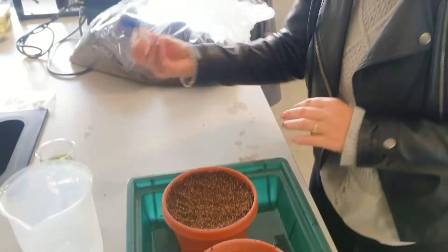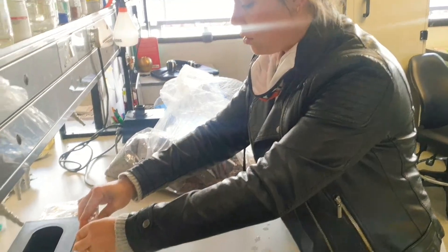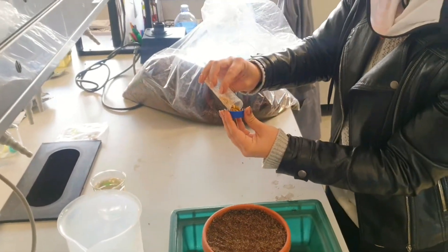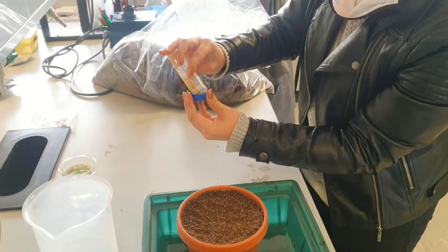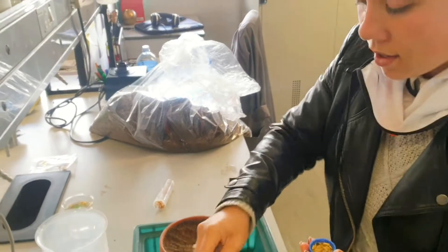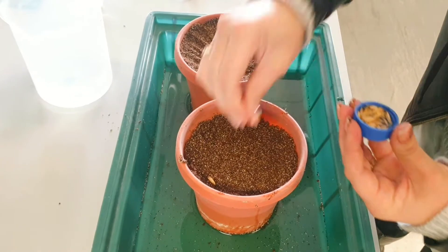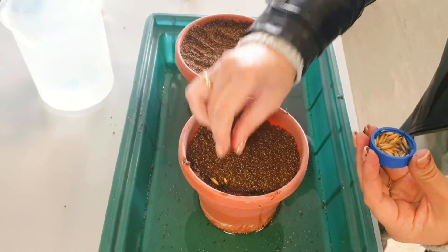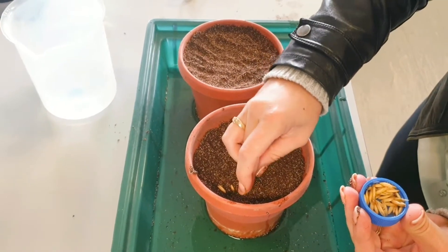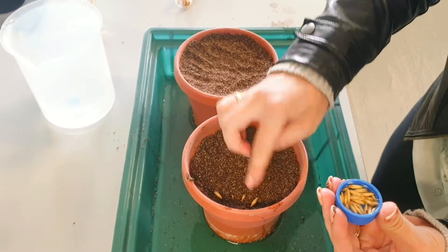Then my seeds that I've soaked the day before — I'll just empty the water out, take some of the soaked seeds, and pour them out so they're easier to grab. I'll just start putting them into the soil. You can really just spread them out; it doesn't matter too much how many seeds you put in, obviously you don't want too many, but just spread them out a bit.